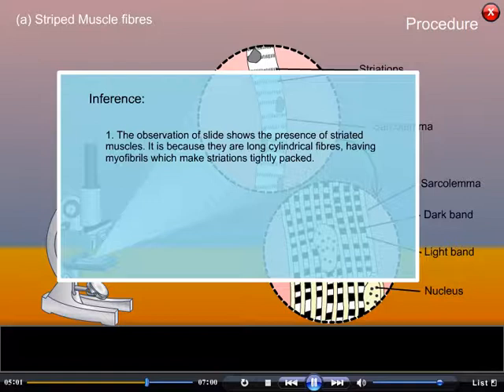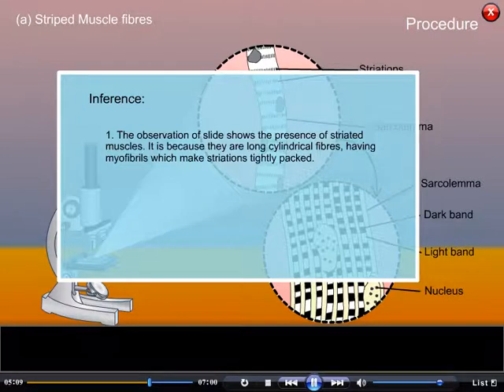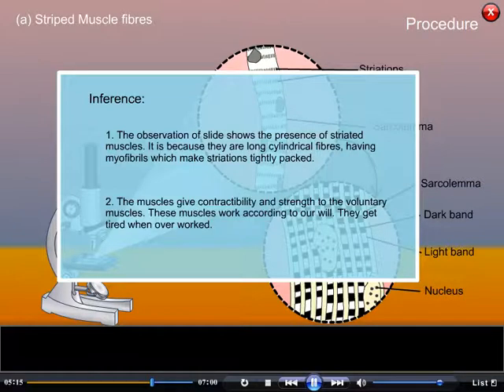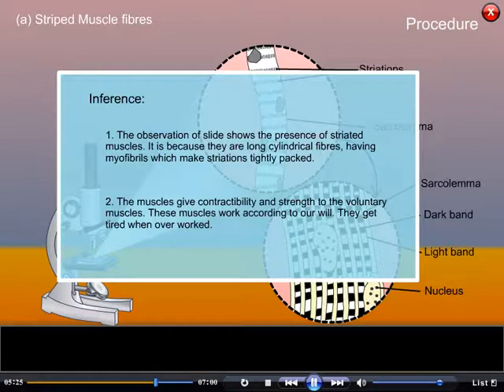Inference: The observation of the slide shows the presence of striated muscles, because they are long cylindrical fibers having myofibrils which make tightly packed striations. These muscles provide contractability and strength to voluntary muscles and work according to our will. They get tired when overworked.